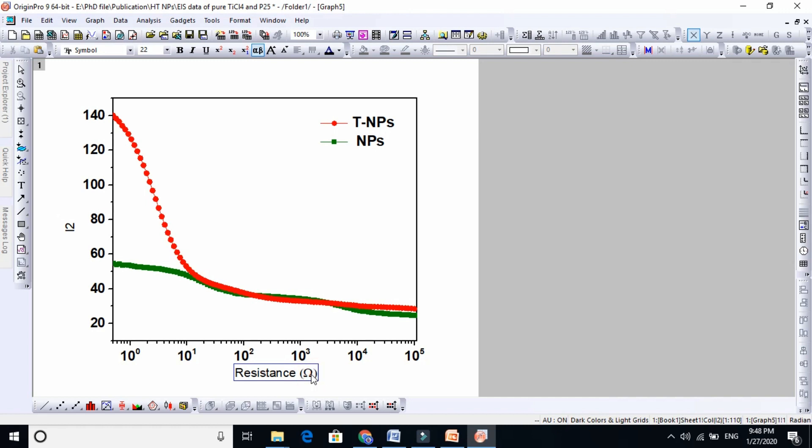Very interesting. If you write here "ohm" as text, it looks awkward and the person will think that you don't know about the units and symbols. So you need to better understand this and get full command on this.